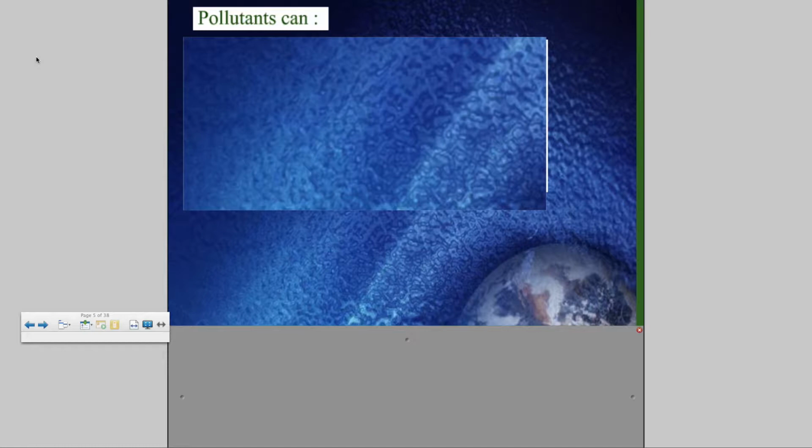Why are we checking for the oxygen levels in water? To see if it's good for fish to breathe in. Yes, because fish do use oxygen. They don't breathe like we do because they don't have lungs, but they do have gills, and they do need the oxygen. We don't have the equipment to check for DO in this environment, so that's one thing that we're not going to check for. But if we were in an environment where we could check for that, that would be something that we have to check for as well. Give me a 4th thing, Patrick.